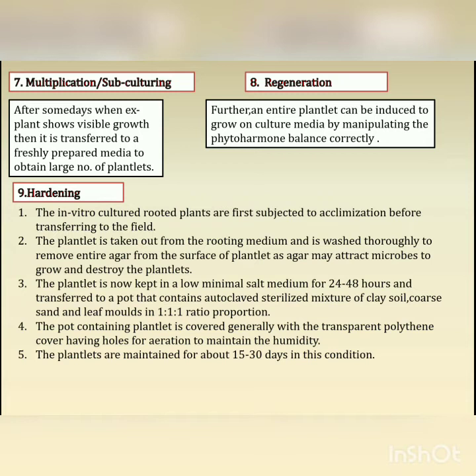After some time, when it has some growth, we have to put that explant again in a properly freshly prepared media, that is in another glass bottle. Okay, so this is subculturing, so that it will get enough space for its further growth and development until it reaches the last stage. Every plant has its own stages. Banana has 8 stages, bamboo has 15 stages for its complete development until it gets ready for the field establishment.